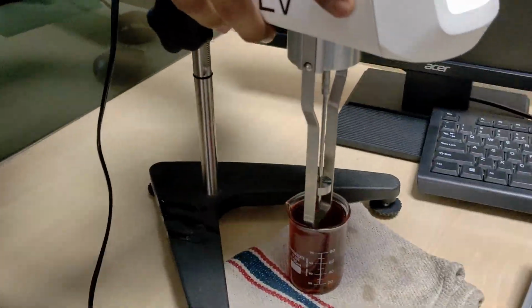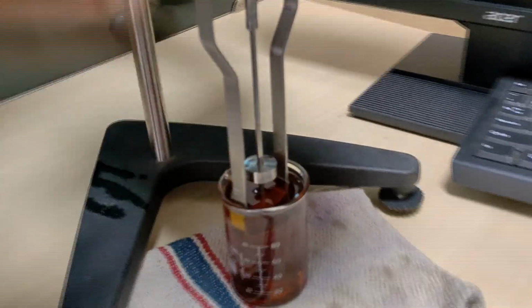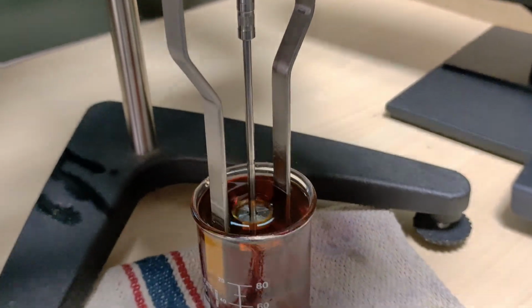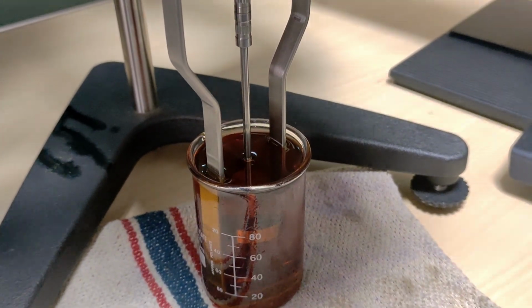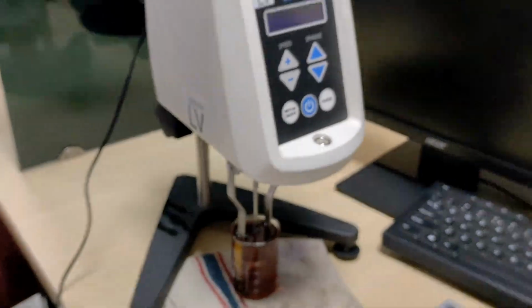And then use the screw to bring the Brookfield Viscometer until level shown here. You can switch on the viscometer.